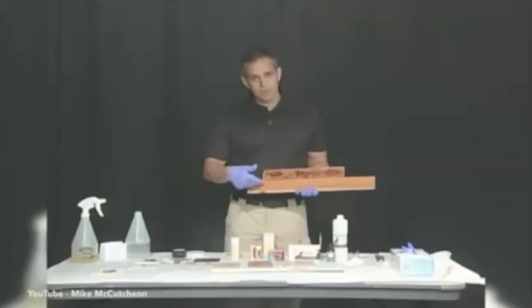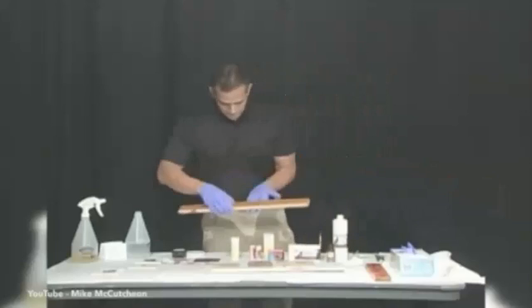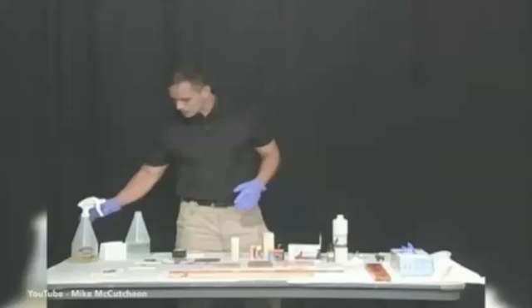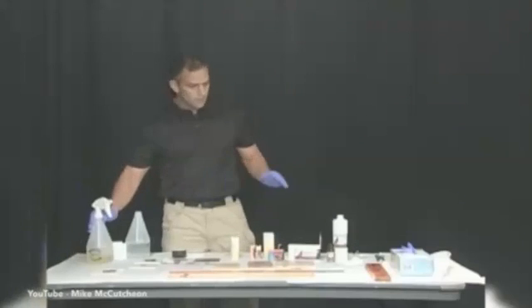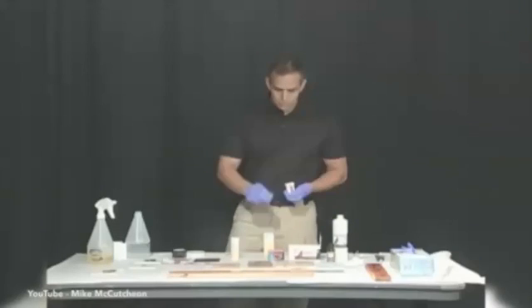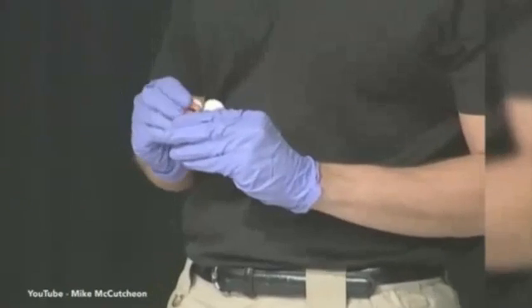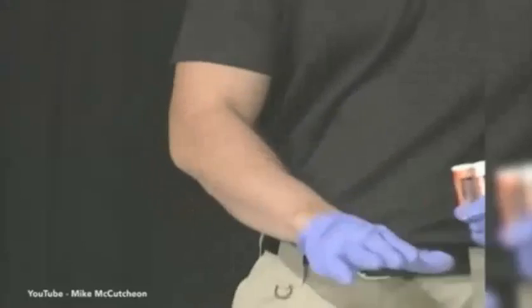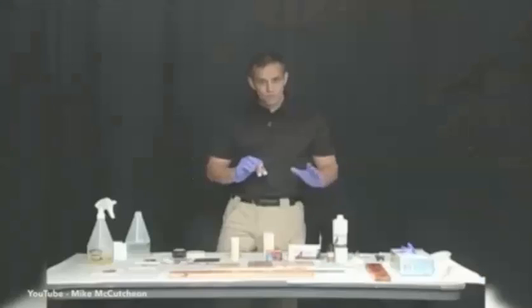To test to see if there's any blood on a surface that's been cleaned, we would use either Luminol or Bluestar. We're going to start with the Bluestar and then mix our Luminol. Now, Bluestar is noted for not destroying DNA once you find it, whereas Luminol will destroy the DNA once it's sprayed on the blood.